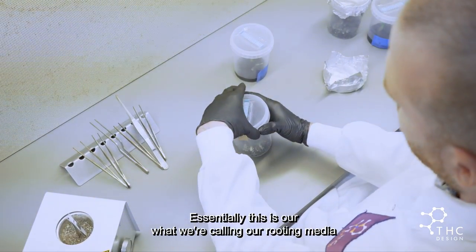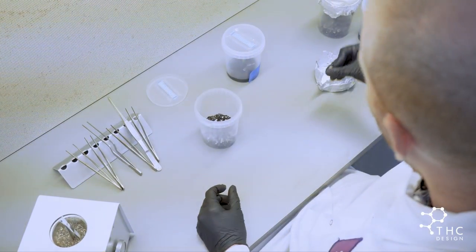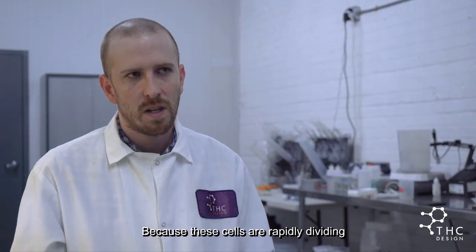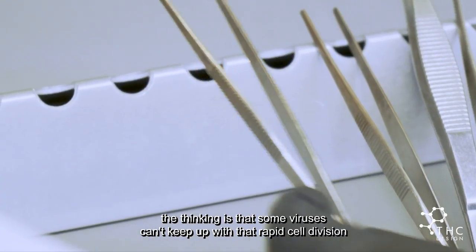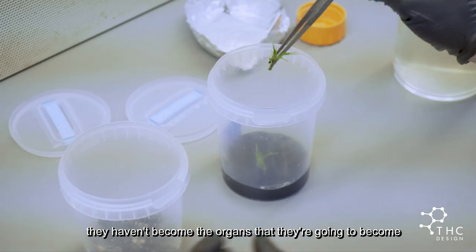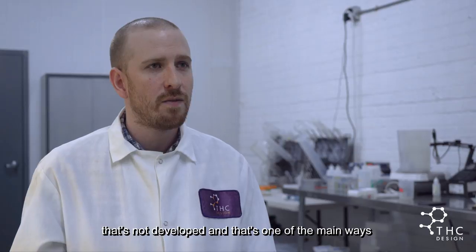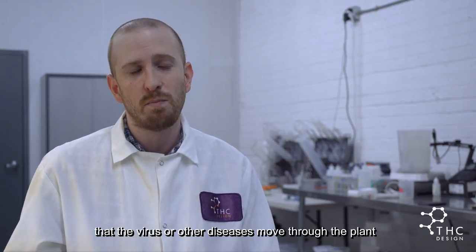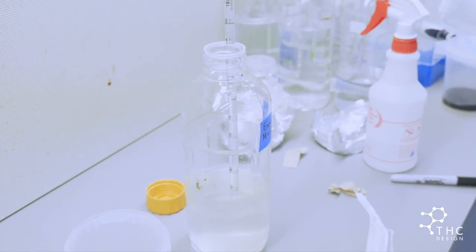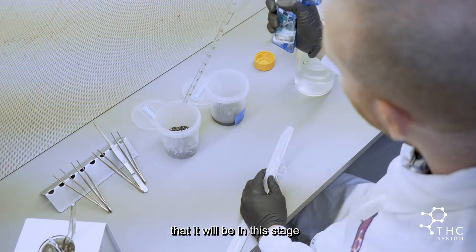This is what we're calling our rooting media — something we're using to get a little more oxygen to the roots. We use aluminum foil as an extra layer of sterility. Because these cells are rapidly dividing, some viruses can't keep up with that rapid cell division. The other reason meristem culture works is that since the cells aren't yet differentiated — they haven't become the organs they're going to become — the vascular tissue, the xylem and phloem that move water and nutrients through the plant, is not yet developed, and that's one of the main ways viruses and other diseases move through a plant. We're adding ten mils of our experimental rooting media, which has some nutrients and hormones — enough to feed the plant for the two to three weeks it will be in this stage.